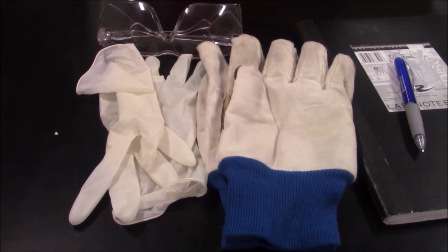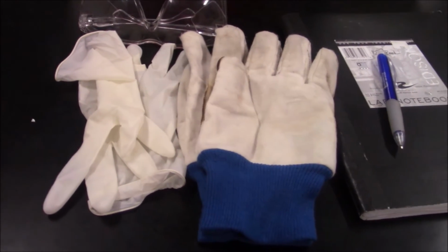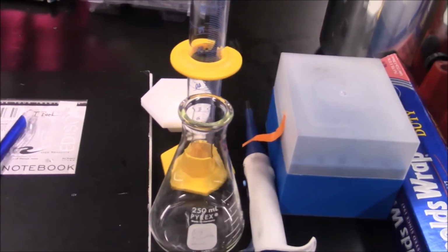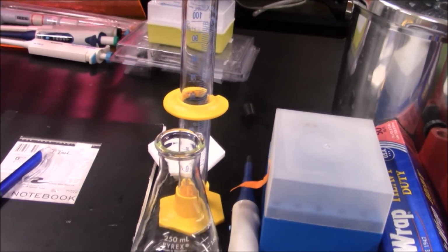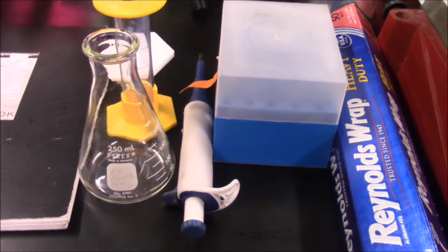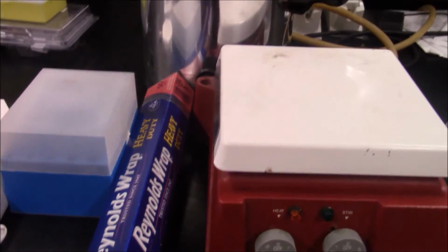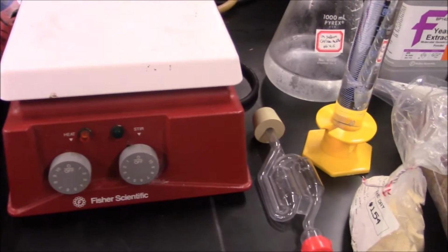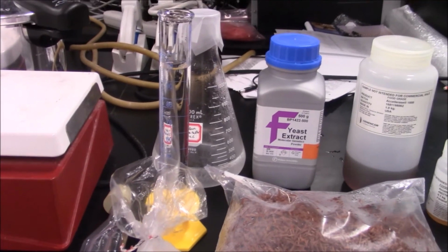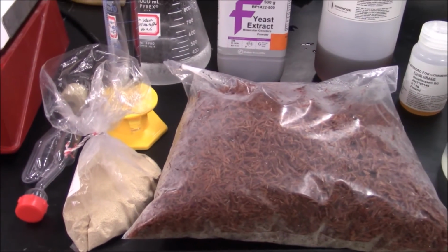For the first phase of the combined experiment, you will need the following pieces of equipment: safety goggles, rubber gloves, heat-resistant gloves, a lab notebook, a pencil, a scale, weighing dishes, a 100 milliliter graduated cylinder, a 250 milliliter Erlenmeyer flask, the 100 to 1000 microliter pipette, pipette tips, aluminum foil, a pressure cooker, a hot plate, an airlock, and a rubber stopper. You will also need the following chemicals: distilled water, sodium citrate buffer, yeast extract, pre-treated aspen wood chips, yeast, Accelerase 1500, Accelerase BG, and 70% ethanol.